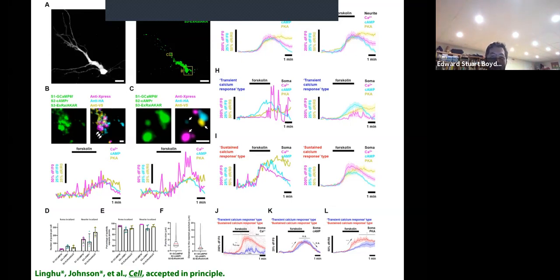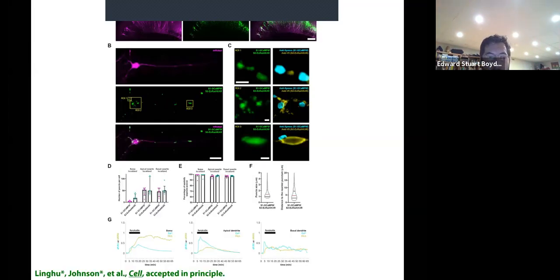This works in the intact brain as well. We delivered these sensors to the mouse brain, and we cut acute brain slices so we could do easier imaging. And we found that the self-assembly still occurred. Here you can see protein kinase A and calcium indicators clustered into dots. After we're done, we bring in antibodies and we can stain them to tell you which dot means which sensor.